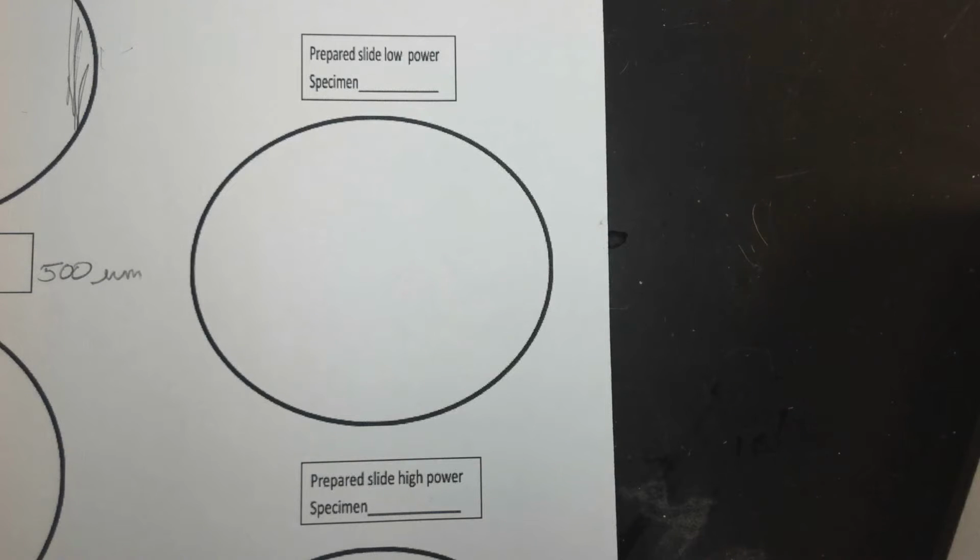So then after you have done the calibration slides, dissecting low and high power, you know how large your fields of view are. Now you're going to use a prepared slide. For the prepared slide for low power, I want you guys to use the paramecium slide that will be at your desks.